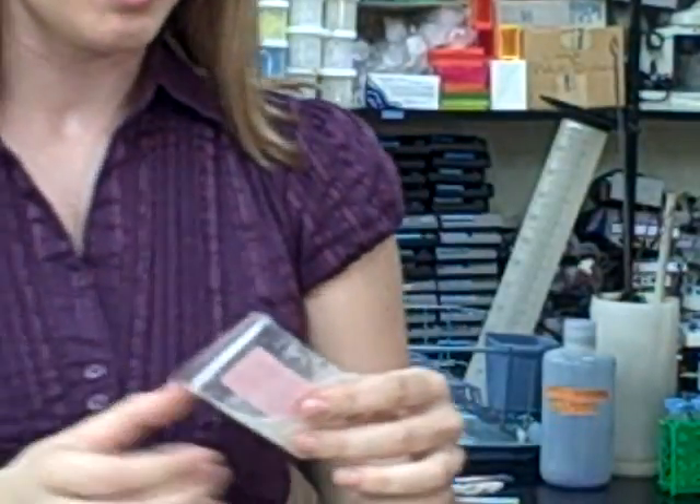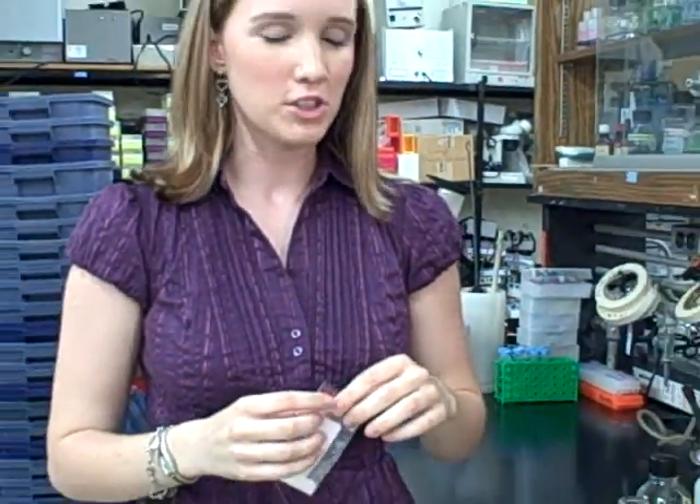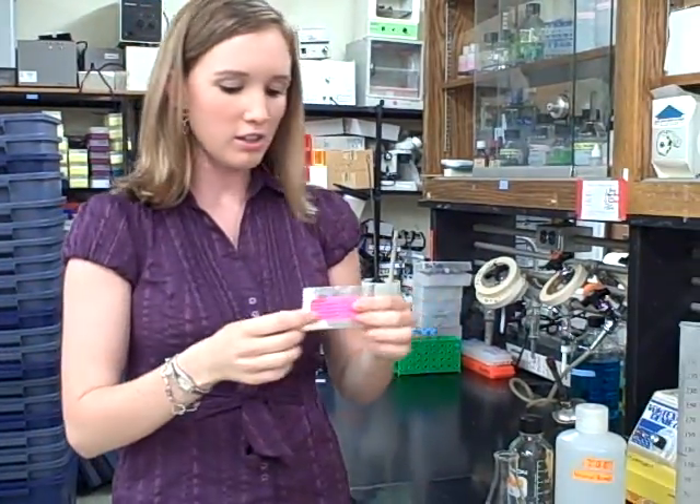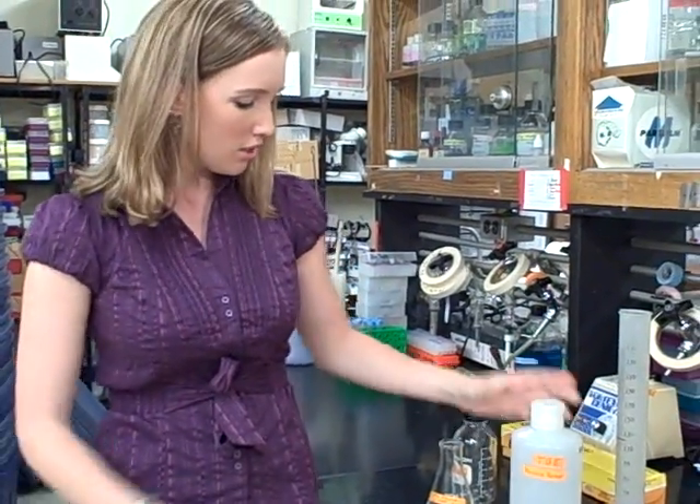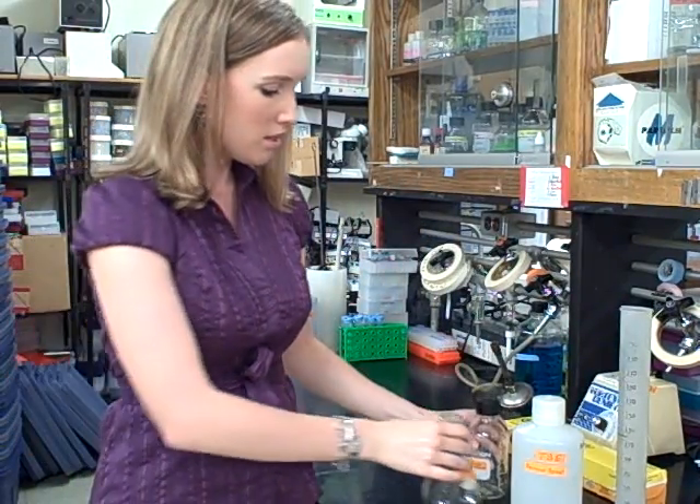Today we're going to be making a 0.8% agarose solution. All you need are the contents of this bag and your TBE solution, along with either a bottle or a flask that is twice the volume of the amount of agarose that you're going to be making.